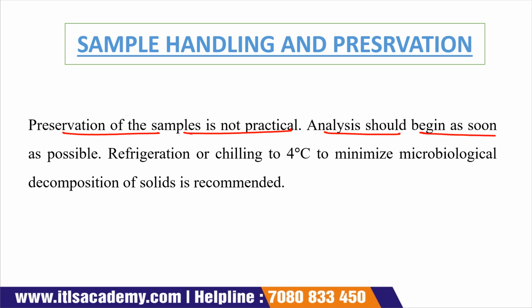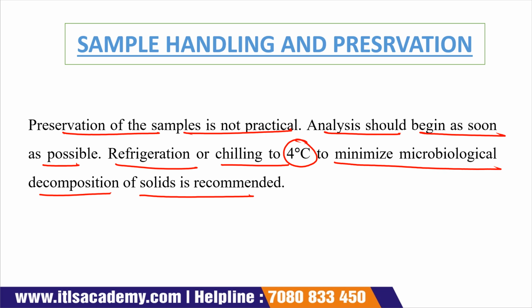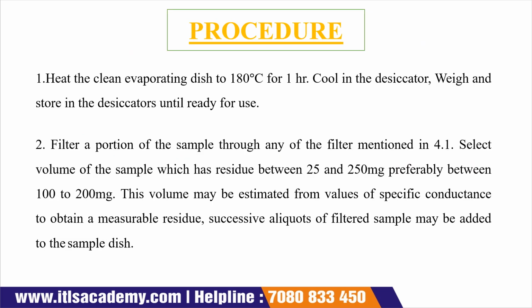Analysis should begin as soon as possible, because when we put the sample in storage, biological changes occur in it, due to which its properties also change. Refrigeration or chilling to 4 degrees Celsius to minimize the microbiological decomposition of solids is recommended. Now the next is your procedure.